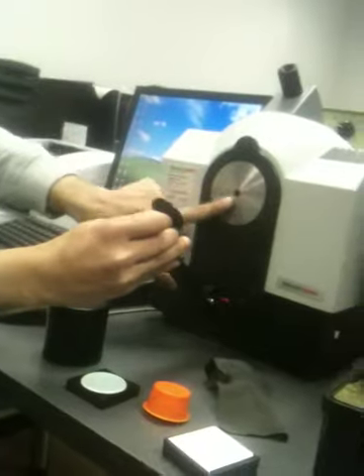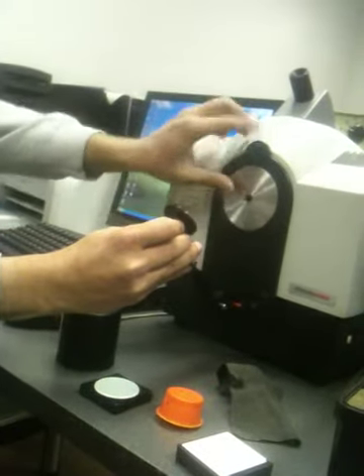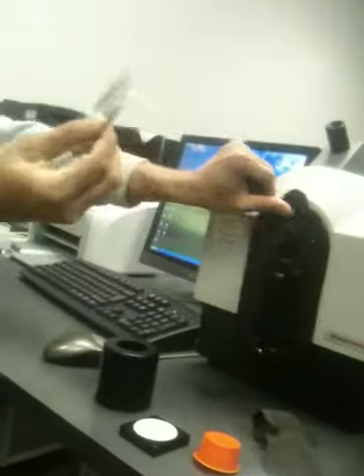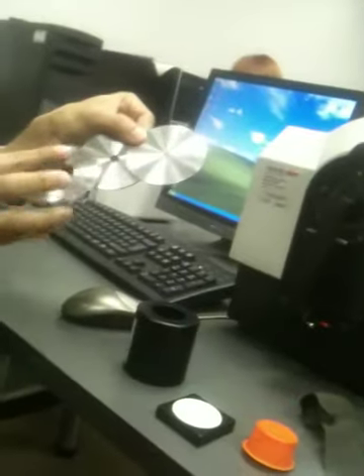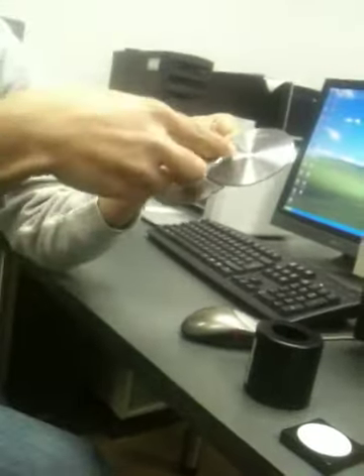Before that, you're seeing a small hole. It's called SAV, small aperture view. We basically have 3 different apertures. This is the small one. This is the ultra small one. And this is the large one. What could be the benefit of this one or this one?